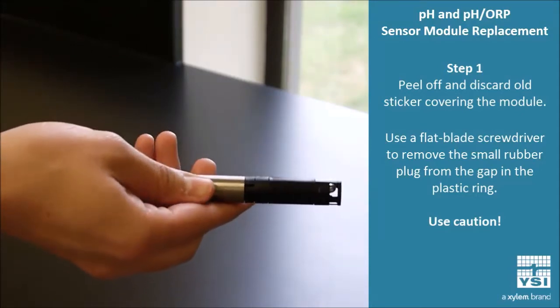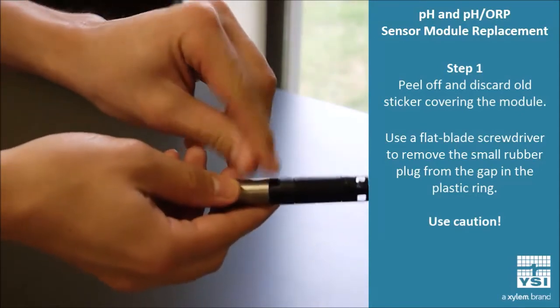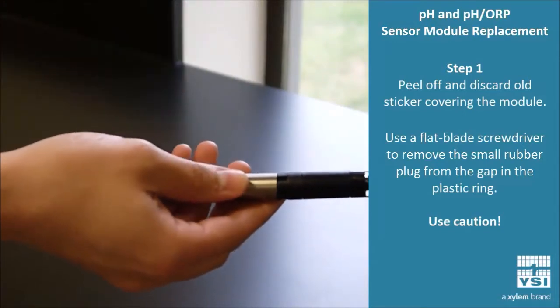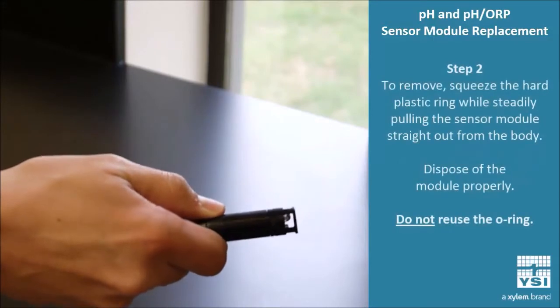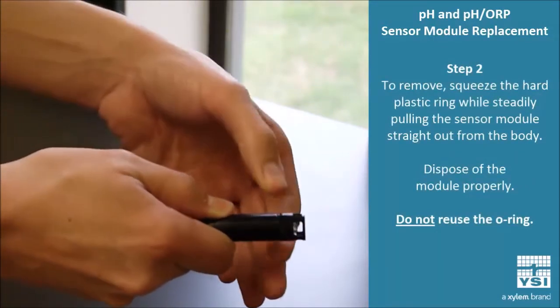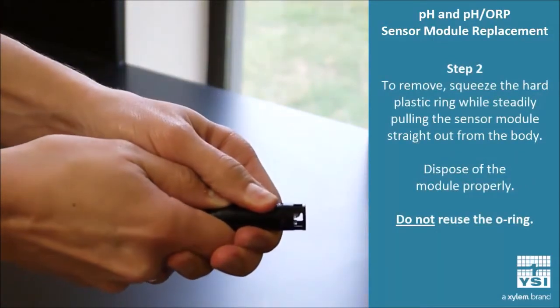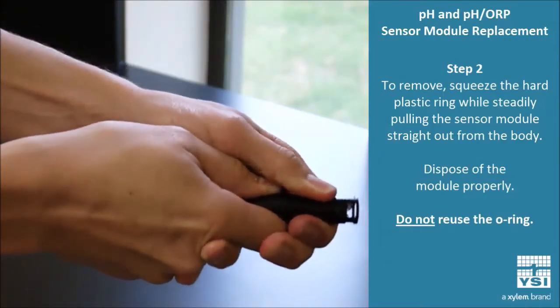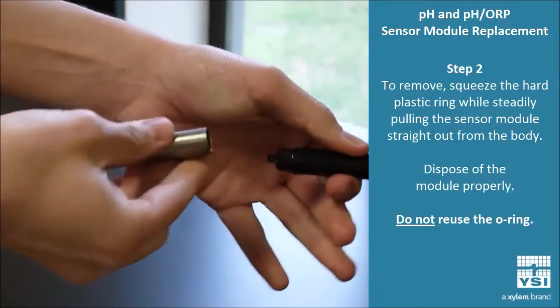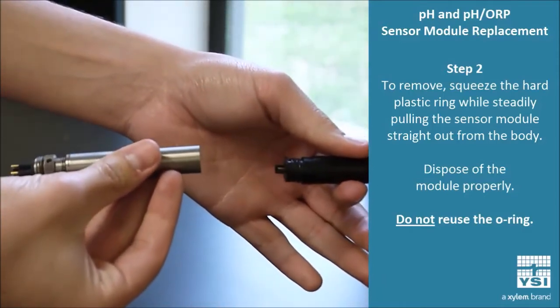Now you should notice that there is an empty space where you just pulled the plug out. So step two is to squeeze very tightly around this area, and then with your other hand, pull the module out. This might be a little bit difficult, but eventually, the sensor should come in two pieces.